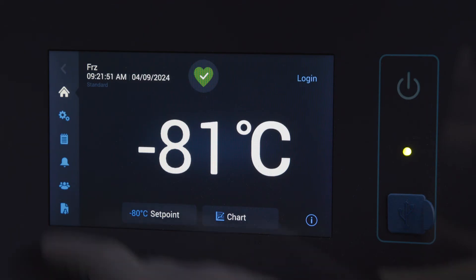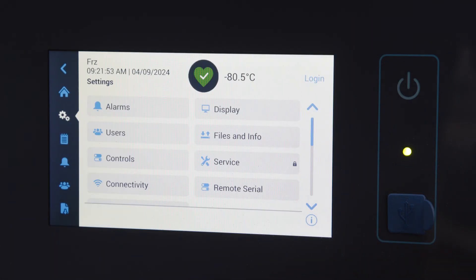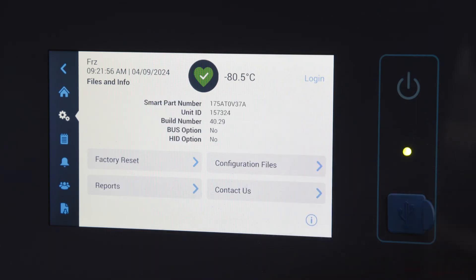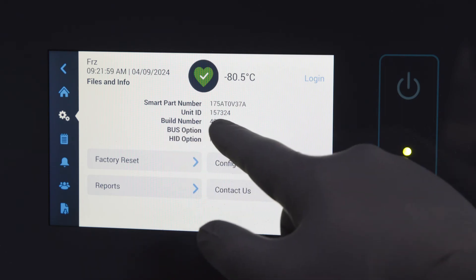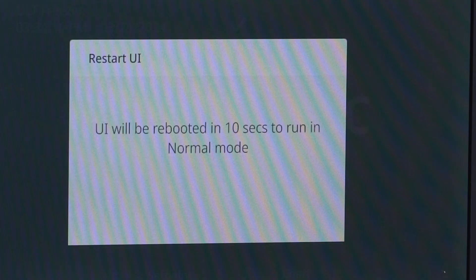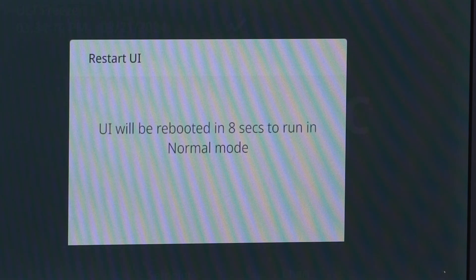Occasionally we will release firmware updates to improve the usability of the UI, and these can be completed by anyone via the user interface — simply obtain the update from our technical support team and install it yourself. We should note that these firmware updates are solely for the user interface; firmware modifications to the main controlling unit of the freezer will still be carried out by qualified service providers.